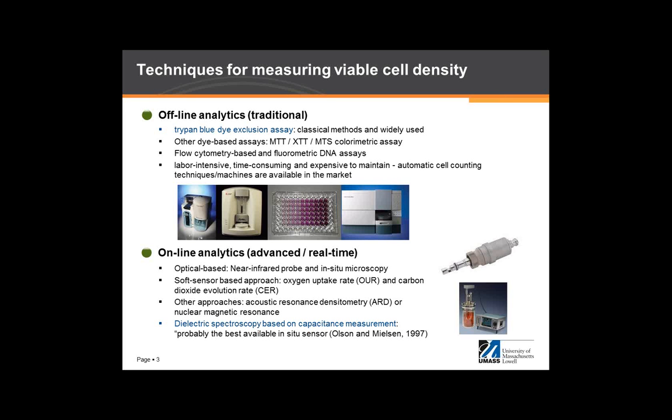So basically there are online and offline technologies, but for future applications of statistical process control and monitoring, those real-time technologies became pretty important and promising for many applications, especially the biopharmaceutical industry. All the unit operations are batch-based, but in the next 5 years, there's a huge initiative and tendency for all the batch processes to be converted into continuous processing.